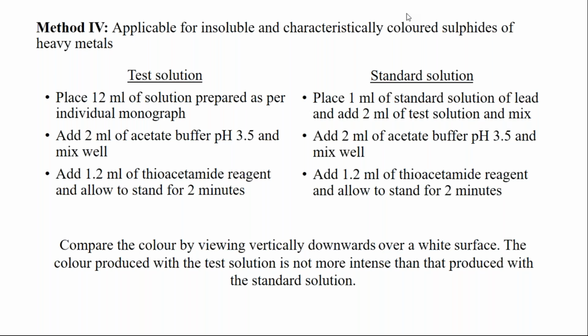That's correct, but there's one major difference. What is it? Okay, I'll tell you. You are not making up the volume here. Are you making up the volume to 50 ml? No. Yes, so that is your major difference. You are not making up the volume at all here.